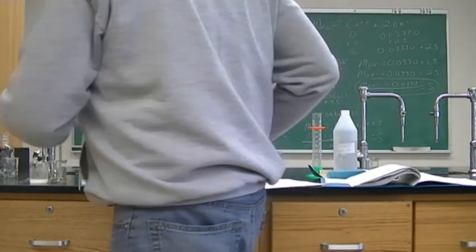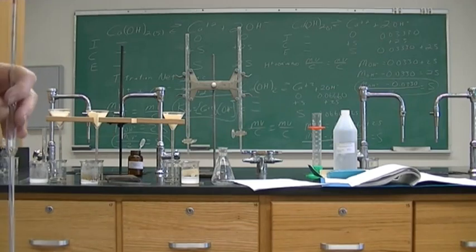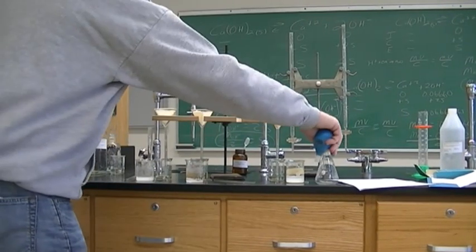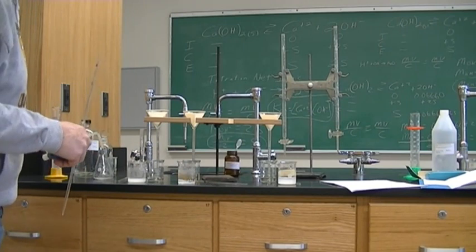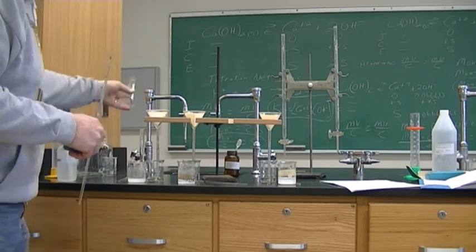All right, so our first solution is over here. Move the camera a bit. It is still filtering. And again, the flask does not have to be dry. It does have to be free of any acids or bases. It does not have to be dry.